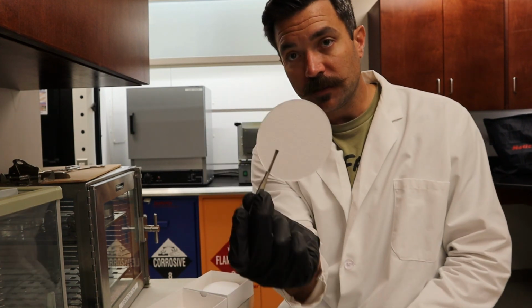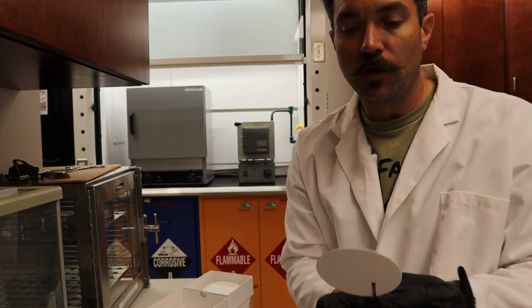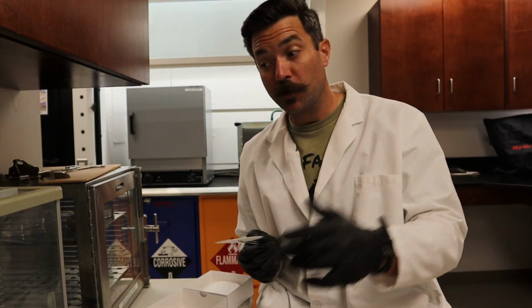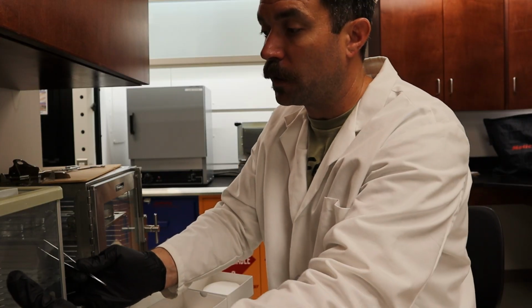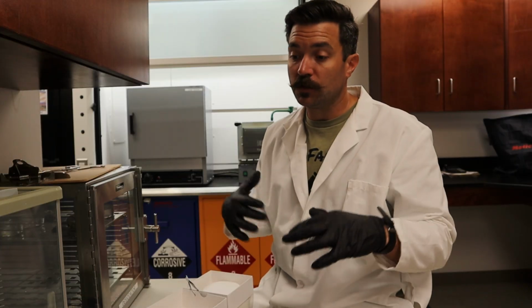Very important part of this is that on your filter you have a wrinkle side and a non-wrinkle side. It's a lot flatter. It's kind of hard to see on camera, but you always want to have that wrinkle side up. Know that. Potential test question. So we are going to just slide that in the balance. We're going to close all the doors and we're going to back up. You don't want a lot of vibrations. You don't want it to be shaken.